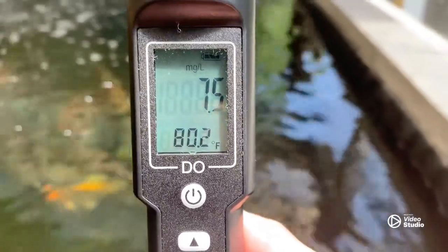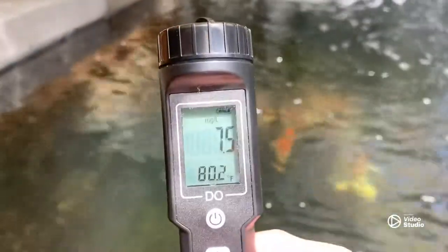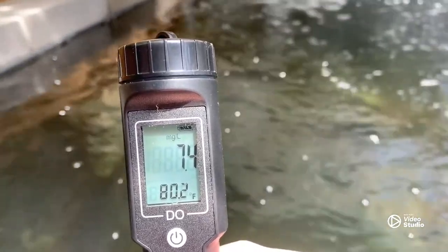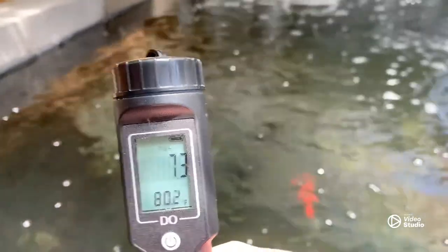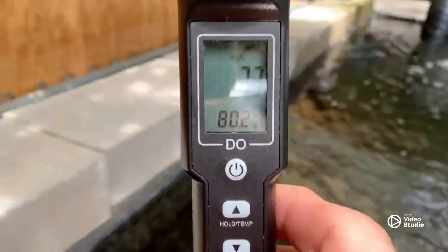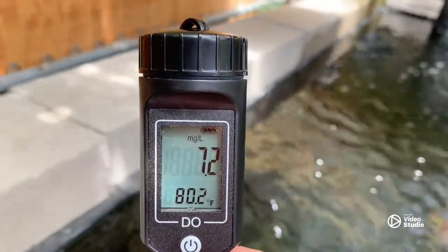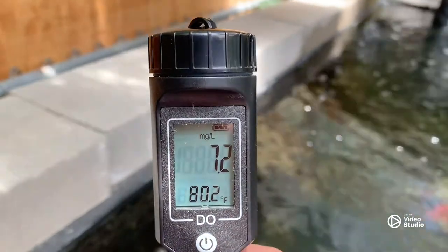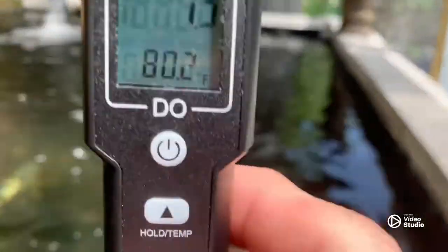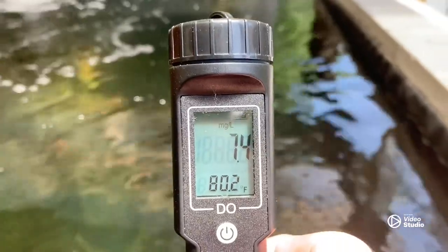If we come back over to where it's calmer it starts to go back down. Going in front of the skimmer — not a whole lot of change going into the skimmer, down to 7.1 — but the return water is better. That's why flow and water movement is important guys.